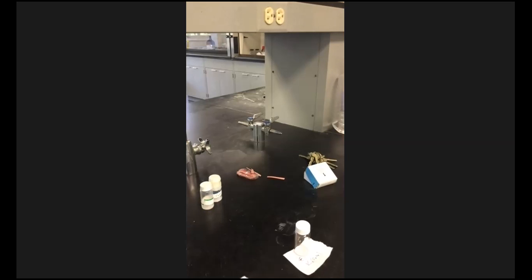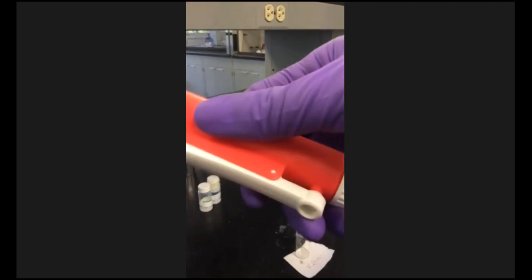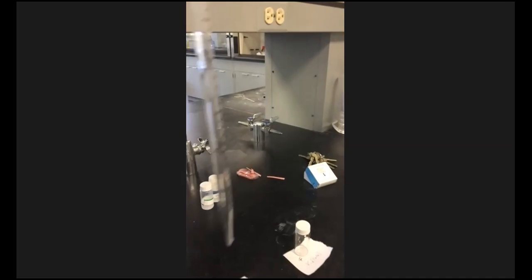Trying to break this thing. All right, so I'm going to use a pipette to take some of that out because I don't want to contaminate the droppers.